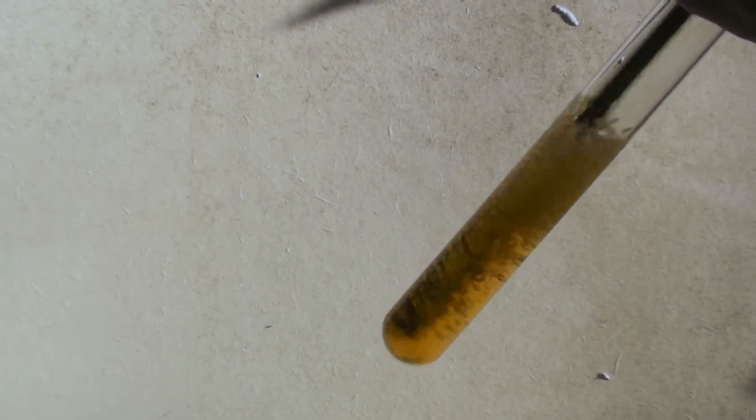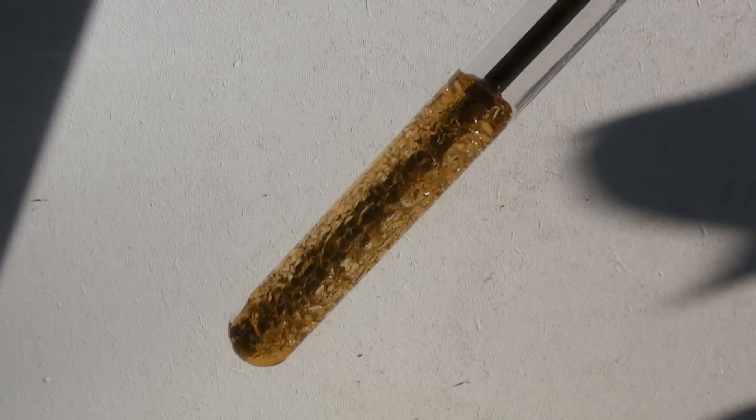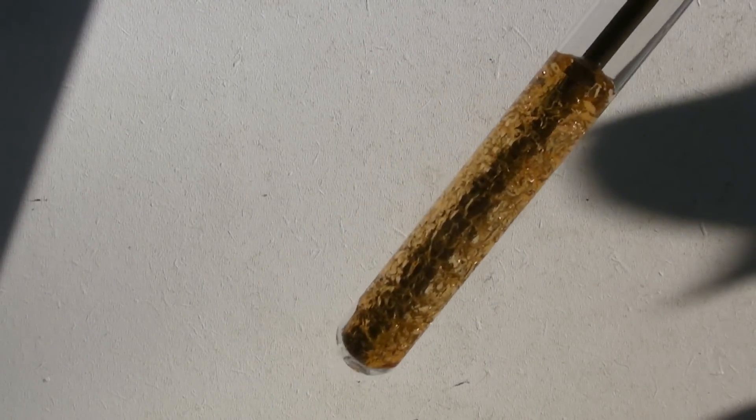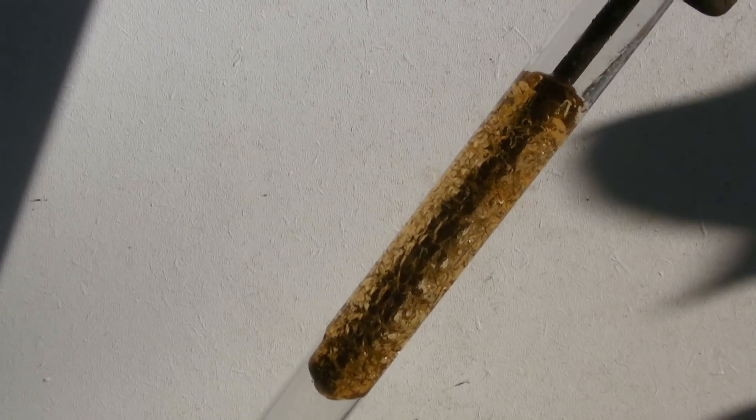After a while the formation of bubbles and the viscosity increase. The stick should touch the bottom of the tube when the mixture solidifies. When it's solid enough, it can be pulled carefully out of the test tube with the wooden stick. This was the case after about 30 seconds.